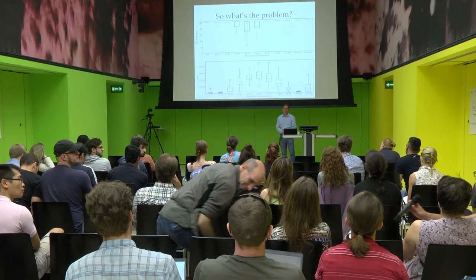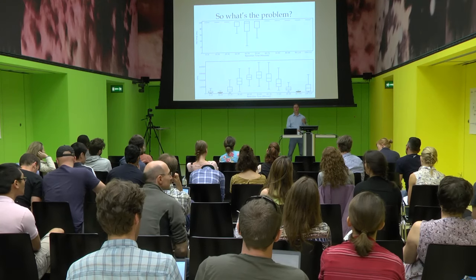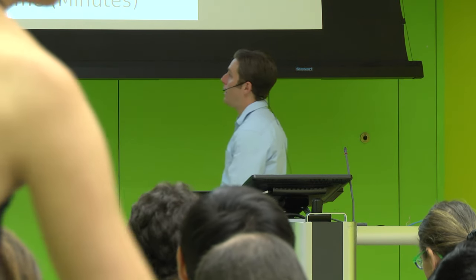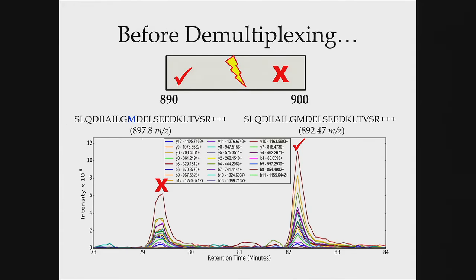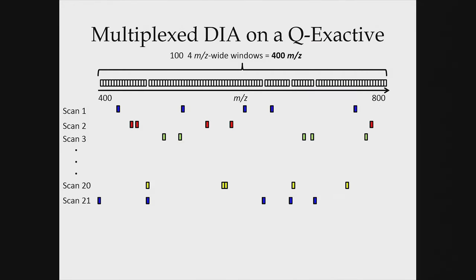Yeah, it would, and it's an example of why the demultiplexing itself is a bit of a challenge. So one caveat of the demultiplexing is that you're comparing these two scans to each other, these neighboring scans, and they have this overlapping information, right? But when you jump out, it's not always going to be the scan right next to it that has the overlapping information that's interesting. It could be 20 scans later.